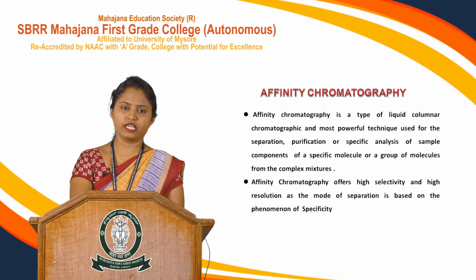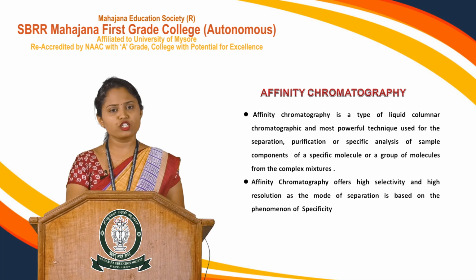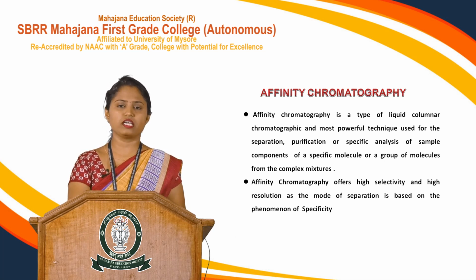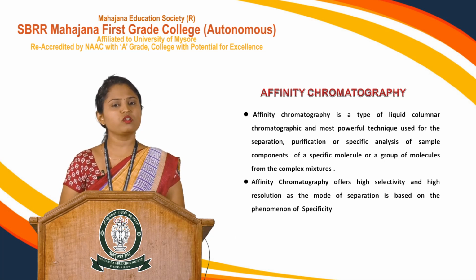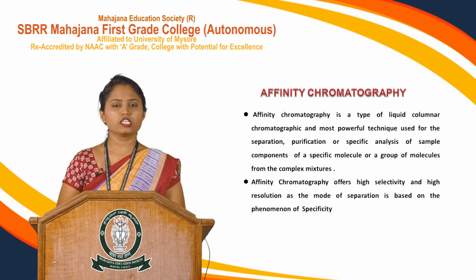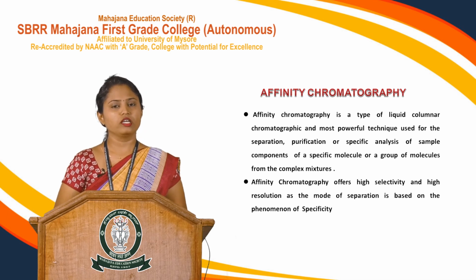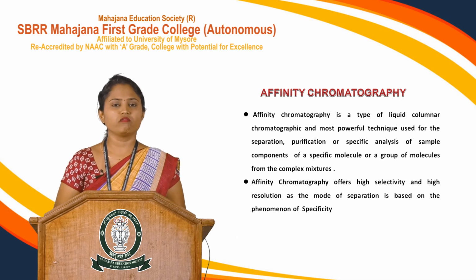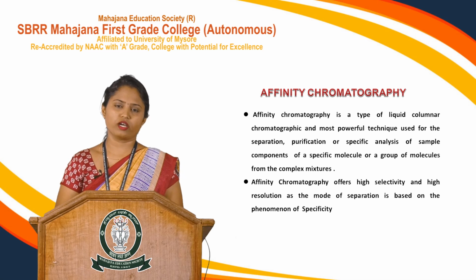Since it is based on the separation of specificity, you can say this affinity chromatography is one of the powerful techniques which has high specificity and high resolution for separations, because the phenomenon of separation is based on specific interactions, which means the mode of separation in affinity chromatography will be the interaction between the biomolecule, that is the target of interest which you need to isolate, and the stationary phase as well as the mobile phase.